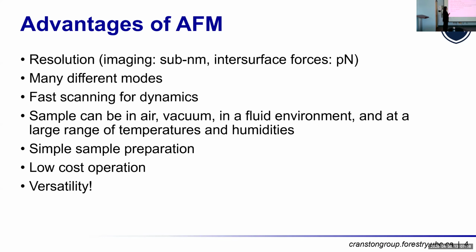Our samples can be in air, vacuum, in fluid environments at a range of temperatures and humidities. So we have a heating stage, you can get hot stages, humidity controllers. We also have a small tensile device that goes in the AFM, so you can pull on it and do mechanical testing and imaging at the same time. But we would say that generally, you don't have to coat your samples, so the sample preparation is pretty straightforward, and the operating costs are really low.